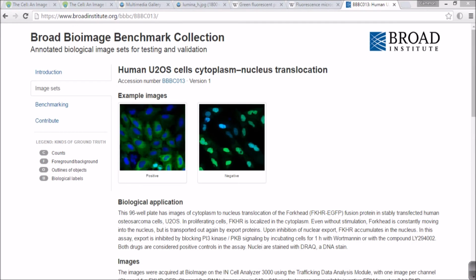Quantitative analysis and automation are the two great advantages of computational image processing and analysis. Together, they make a lot of information available from biological images.